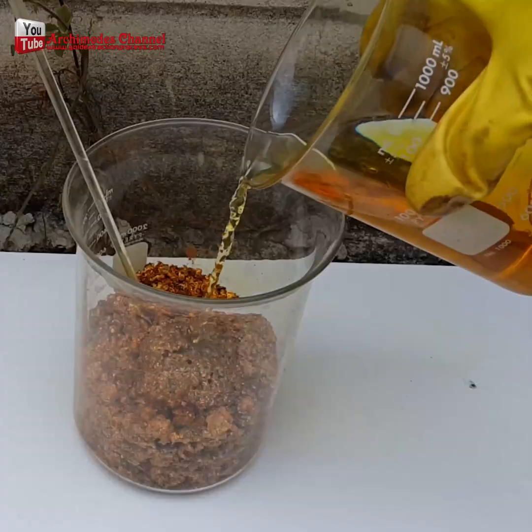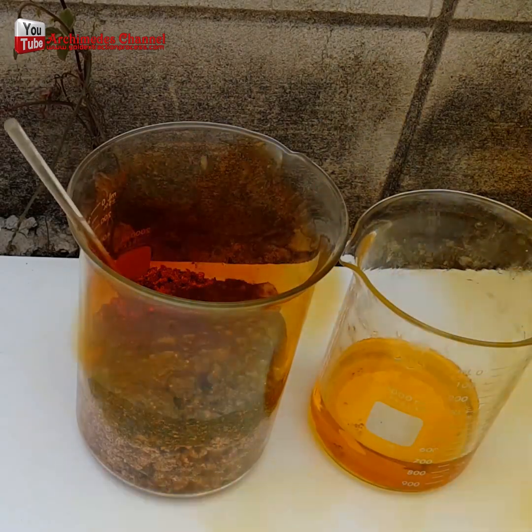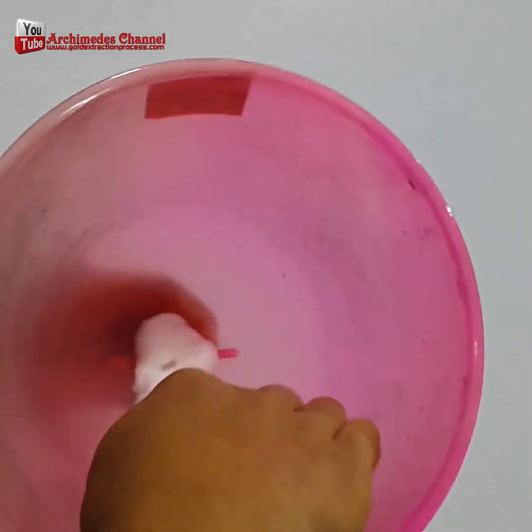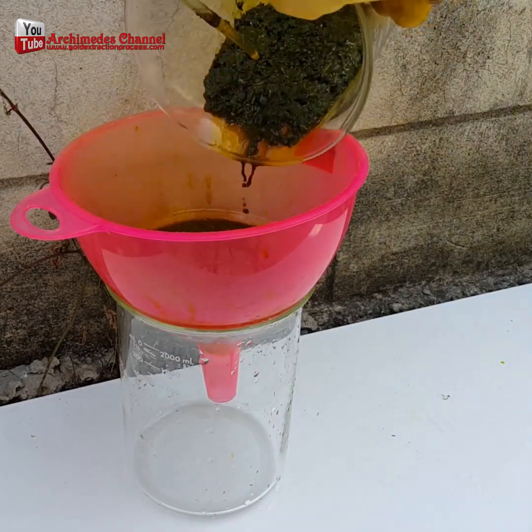Check out this amazing process of refining gold scrap into 24 karat gold. In this case, that scrap was picked up from a factory, and an aqua regia solution comprised of three parts hydrochloric acid and one part nitric acid was added.